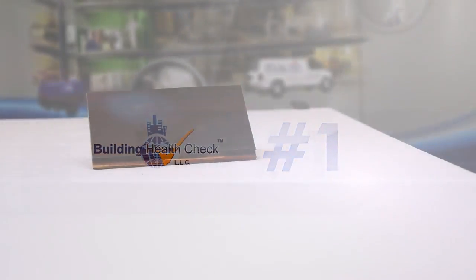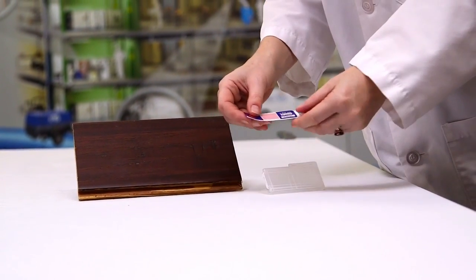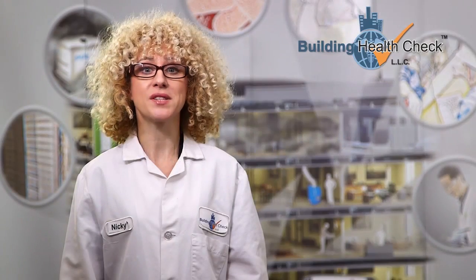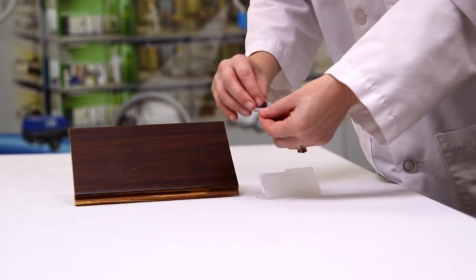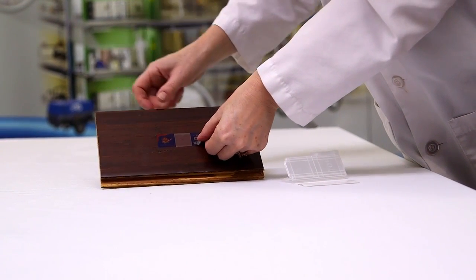Select a surface where you spend most of your time. Step 1: Remove the plastic case from the secured sealed bag and remove the Bioscan 400. Step 2: Carefully peel back the Bioscan 400 from its wax paper backing just far enough to expose the red grid. Step 3: Place the sticky side of the red grid against the surface you wish to test.